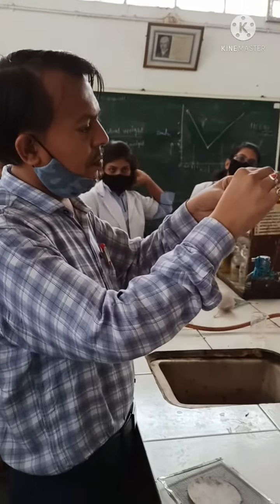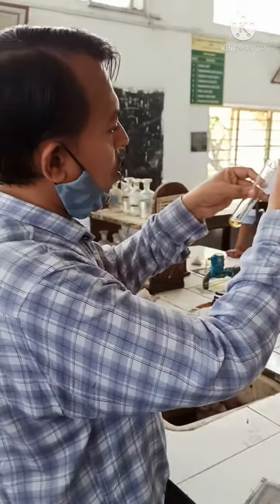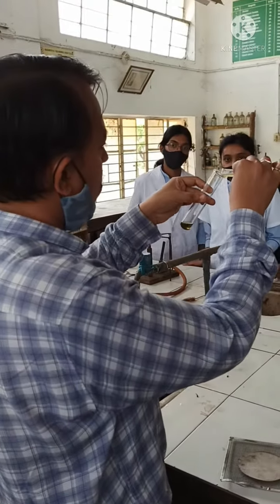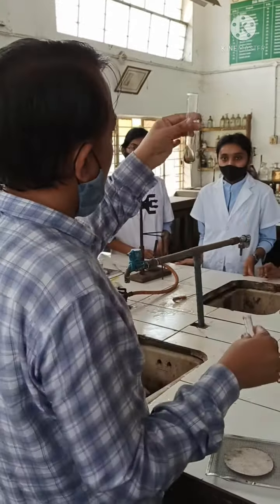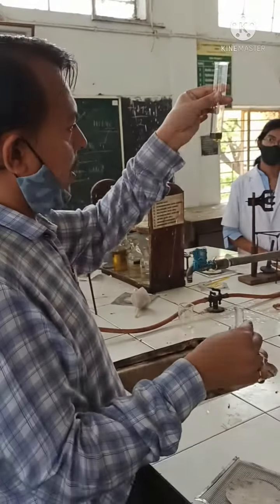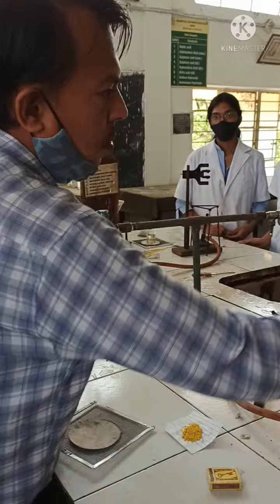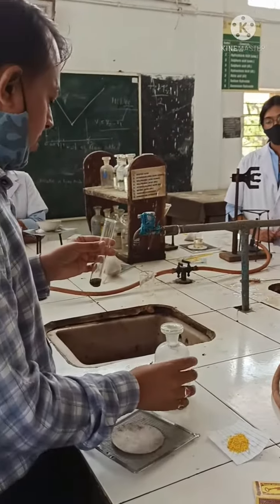This is my sulfate solution and we have already prepared the sodium extract. One drop, two drops — you want something like a thick precipitate like this. After that, you have to add one drop of NaOH.